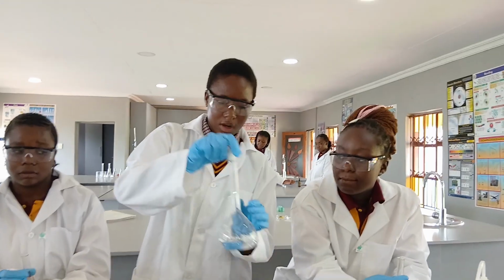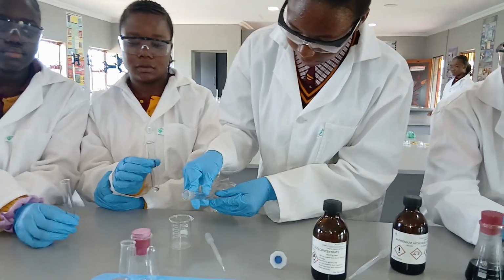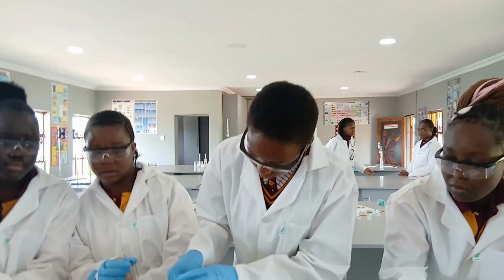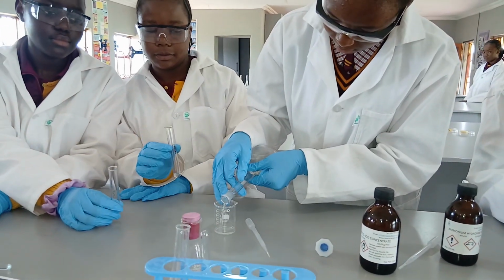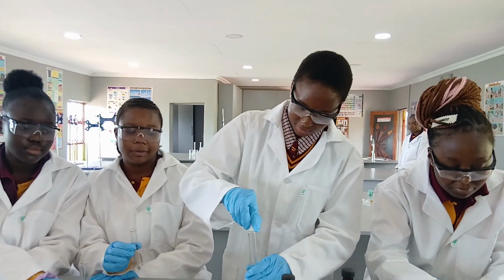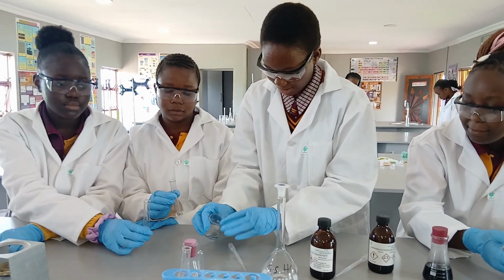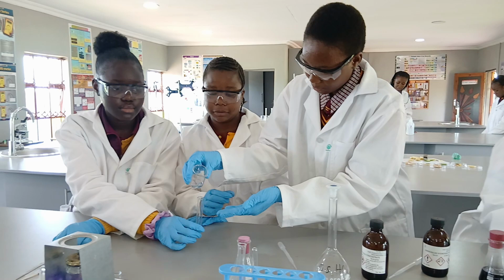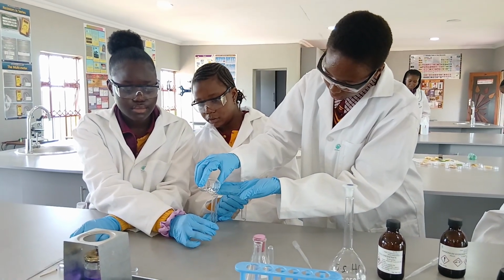And lastly, we are going to pour our hydrochloric acid into a beaker, and pour it into test tube 3, for we're only going to pour a little bit.